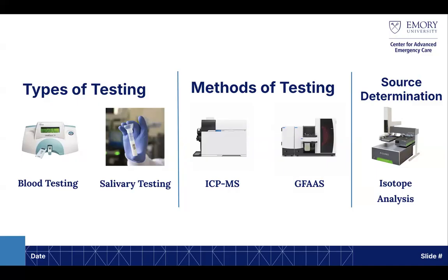Now, the preferred method, the more definitive method, such as ICP-MS or the graphite furnace technology, those are more definitive, as you said. However, they are less available. So we had to ship these samples to the US or to Italy, in our case in Tbilisi, to be able to get these results, which can be difficult. That said, it is the gold standard result.